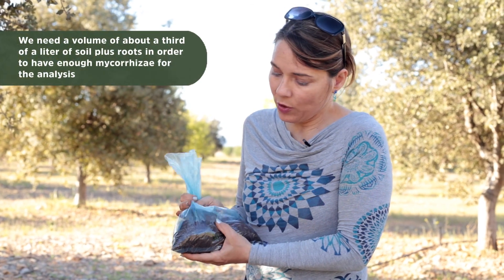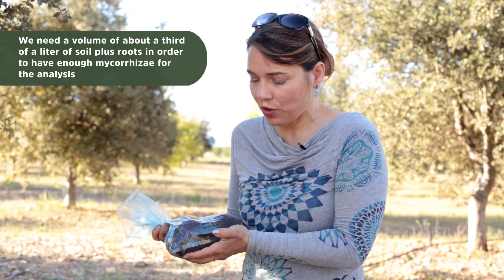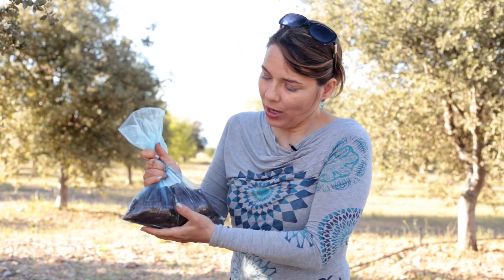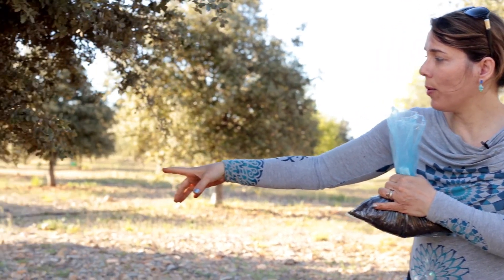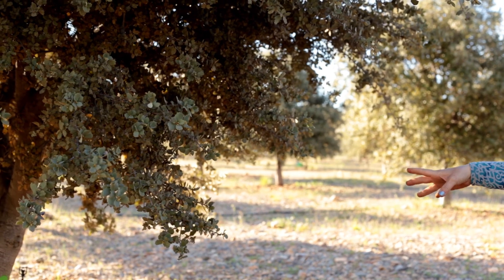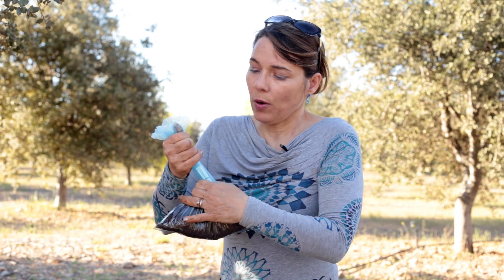Now we have the sample. I always say you should put about half a liter to a third of a liter of soil with roots. A third of a liter is roughly the size of a soda can — like a Coca-Cola can — so you have an idea. This sample here is more like half a liter. The label is on the bag and the tree is labeled too — it's very important so we can afterwards know which sample, which analysis, and which results belong to which tree.